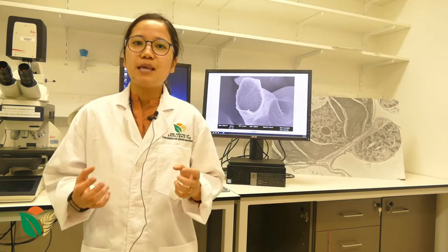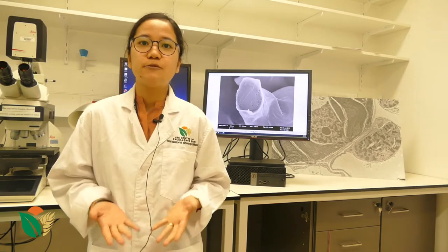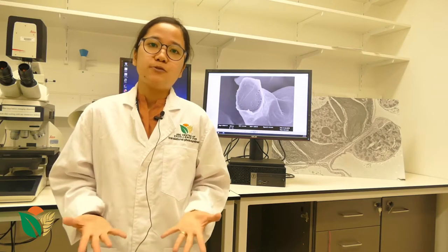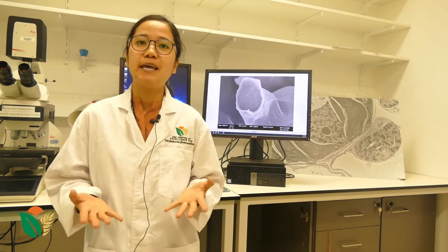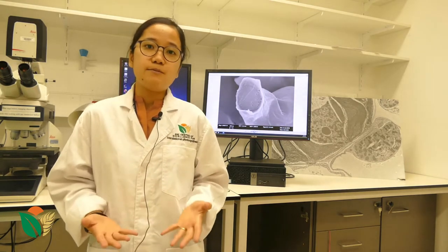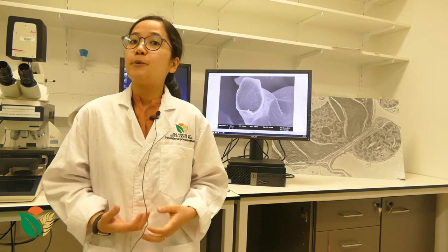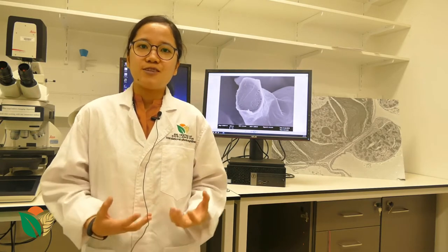Therefore, it needs to be imaged under a special microscope called an electron microscope. An electron microscope uses an electron beam instead of light during imaging, and this kind of special imaging allows for far higher magnification than a normal light microscope. A light microscope can magnify an image up to below 2,000 times, but an electron microscope can magnify up to 10 million times what we can see with the naked eye. For me, that's very important because dealing with Plasmodesmata, I need that special kind of imaging to see the structures I'm interested in.